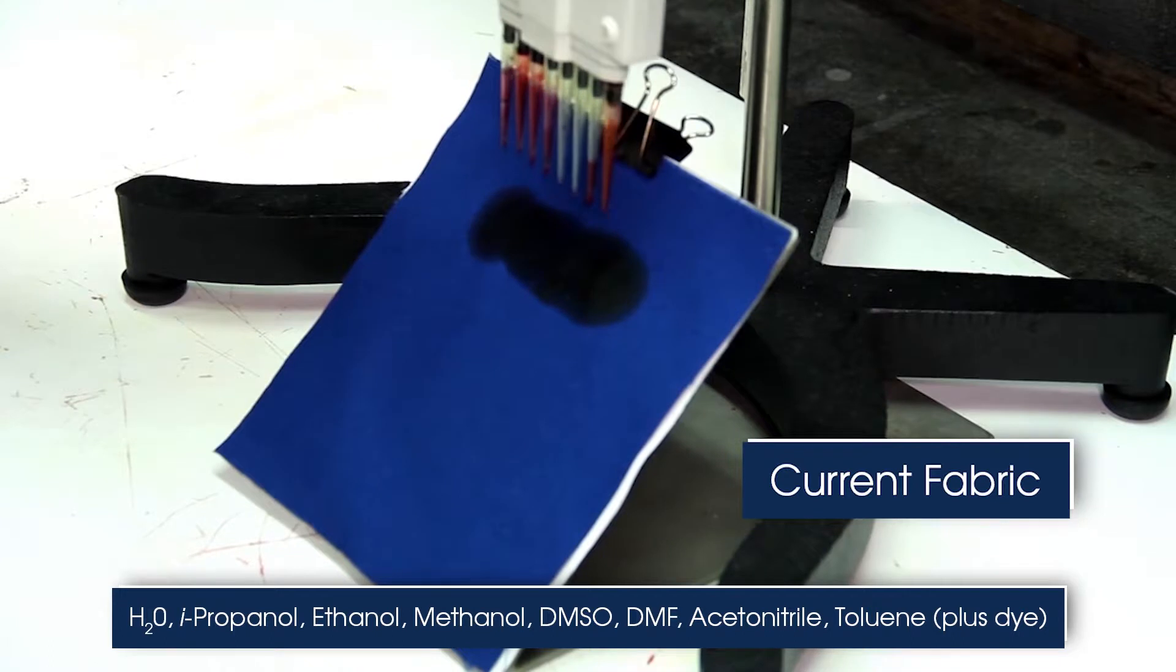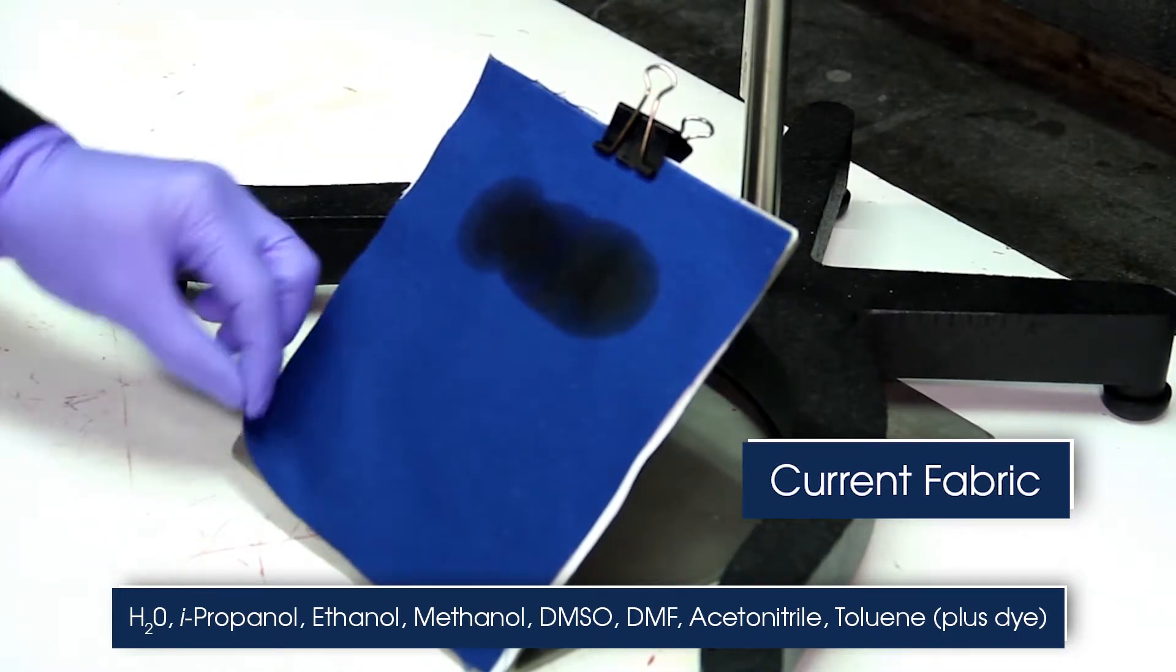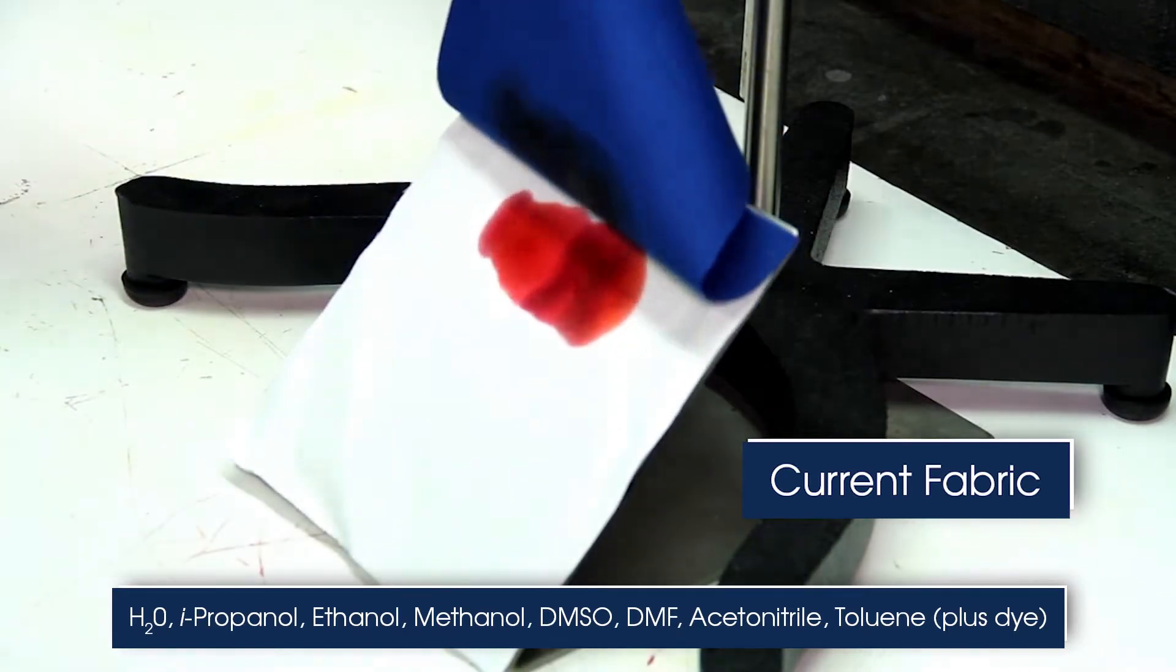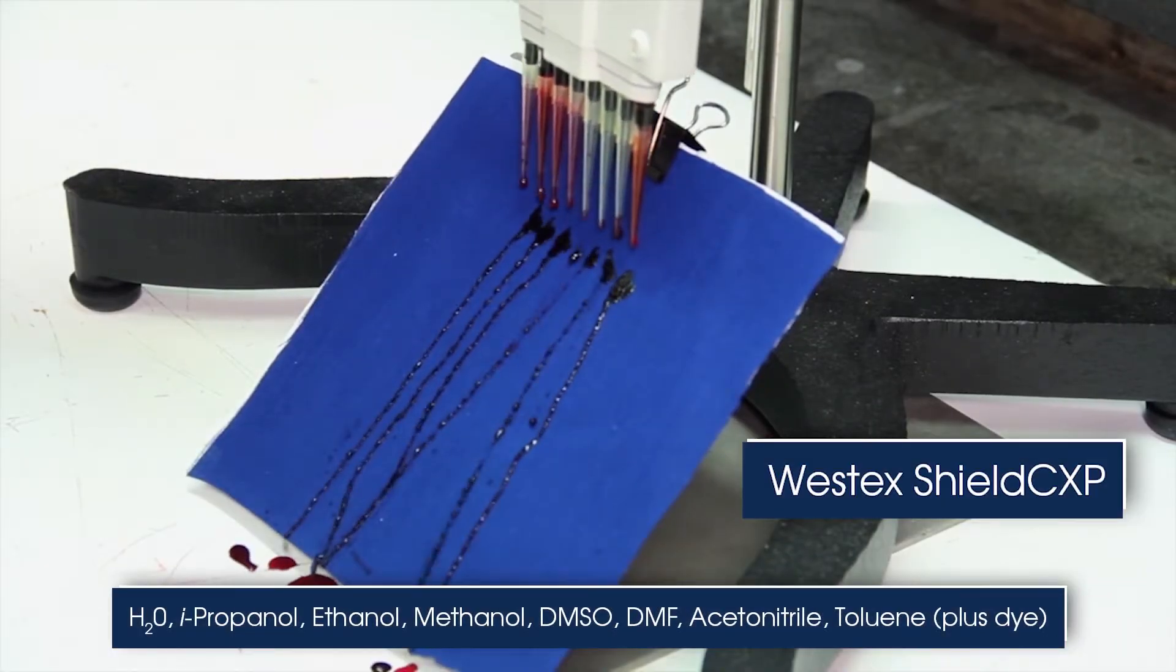And in this demonstration, you can see how the various liquid chemicals easily penetrate through the current fabric, but when they're released on a Shield CXP, the liquids quickly roll off the fabric without penetrating it.